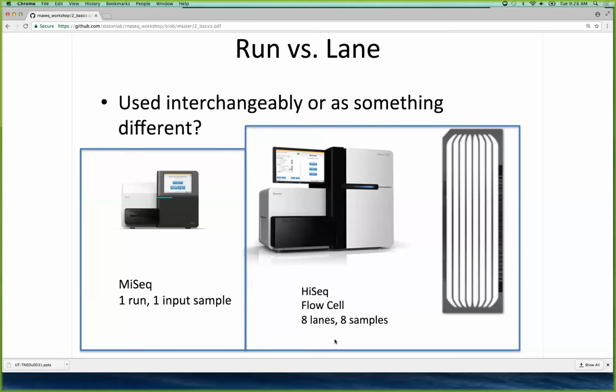And usually this is Jim's lane, and this is Vitaly's lane, and this is Meg's lane. A lot of times you're sharing that with a bunch of other people because it's rare. I mean, I guess if you work certain places, maybe it's not rare, but for us, I would think it's rare for anybody to buy 8 full lanes. It's just so much data.